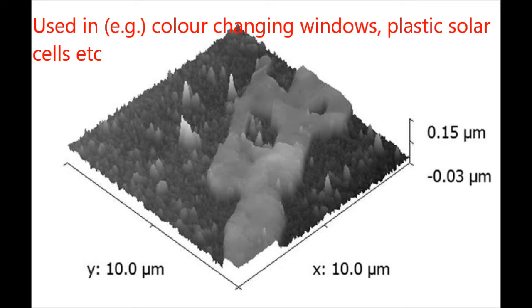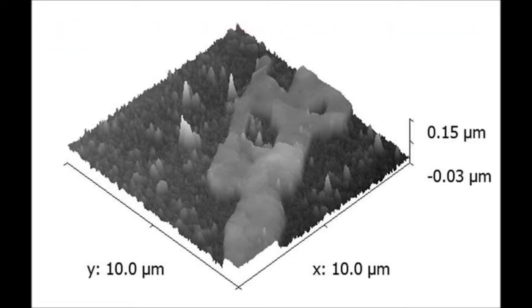That might be a lot of information to be given at once, but can be easily simulated with a model. Here's one I made earlier. The laser pointer contains a laser diode. This arm is the cantilever. The drawing pin represents the sharp tip on the cantilever, and the mirror on top allows the laser to reflect off of the top of the cantilever.